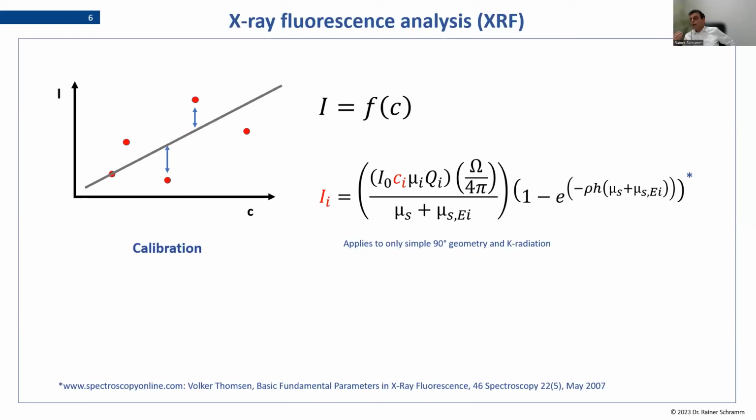There we can only go by experience that we know in a sulfidic ore, we have a mixture that some elements are present as sulfides and some elements are present as oxides, but this is just empiric. So it can only be defined, and then you have to live with this definition. The standardless software cannot handle this in general.